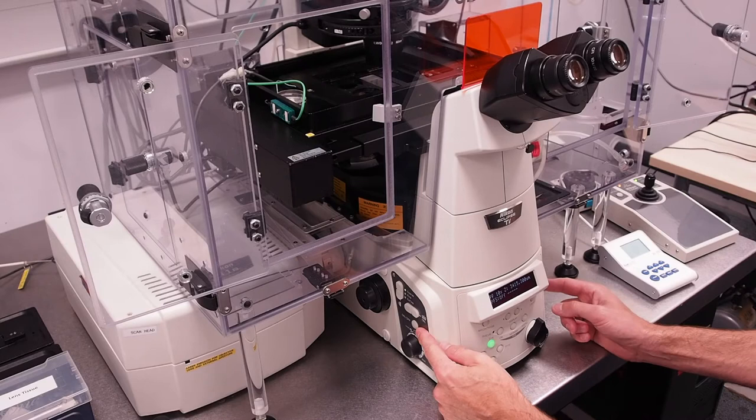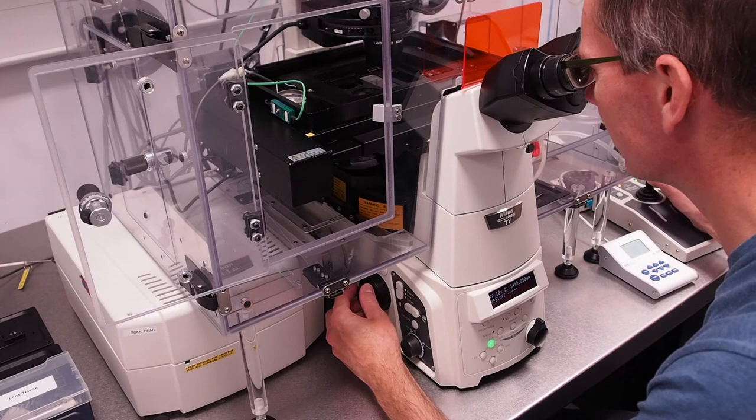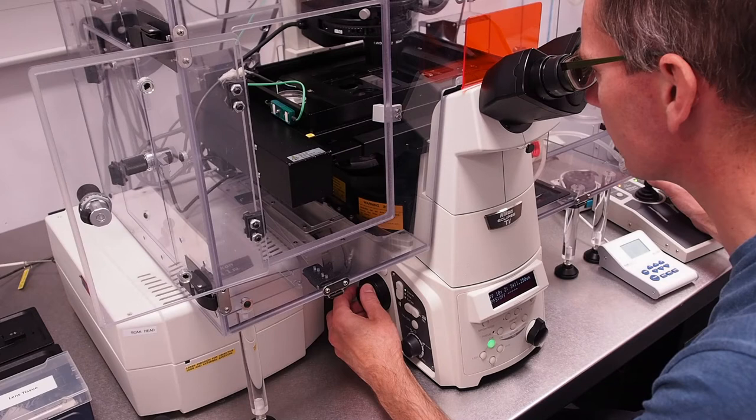Now open the transmitted lamp shutter using the button on the left and using the focus knob and joystick find your sample and focal plane. Once found switch the lamp off with the same button.